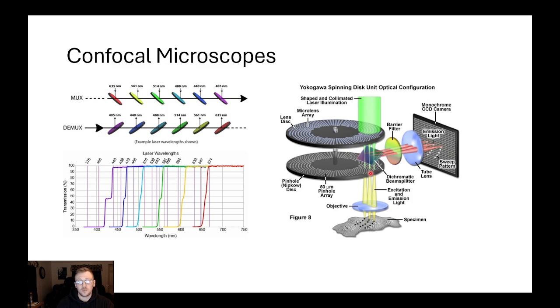The reason this is really important is now we have X and Y resolution, right? We can see things on a flat plane. So if we're looking at our specimen here, we have X and Y resolution, but we also want to be able to convey depth of our samples. It's called Z-axis, and we want to be able to see things in our Z as well. We want to know if a nucleus is not flat. A nucleus is a sphere that has a certain depth to it.